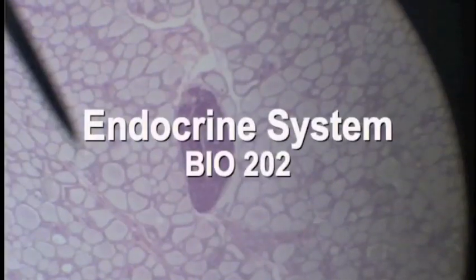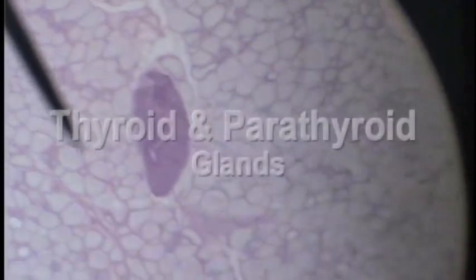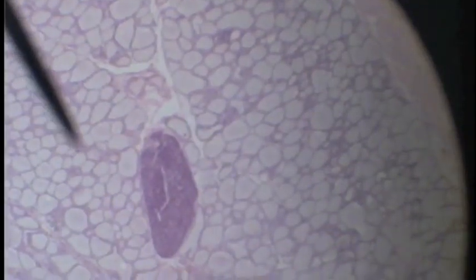This is a cut through both the thyroid gland and the parathyroid gland. Here we see the parathyroid gland, and the tissue surrounding it is thyroid. Parathyroid and the thyroid surrounding it.